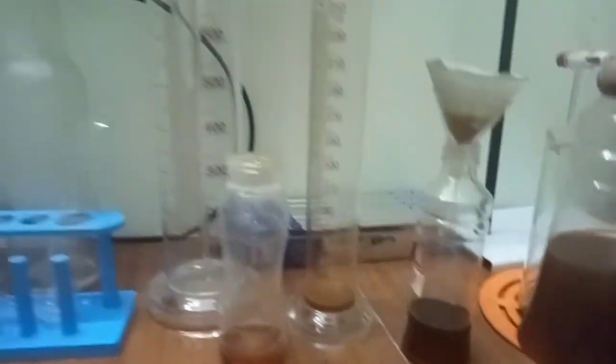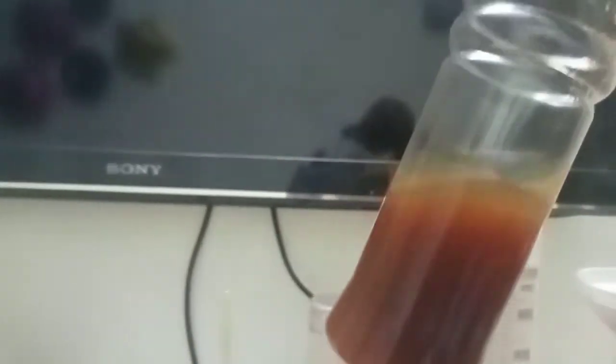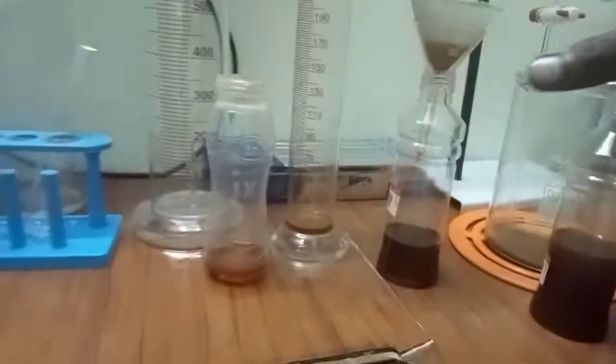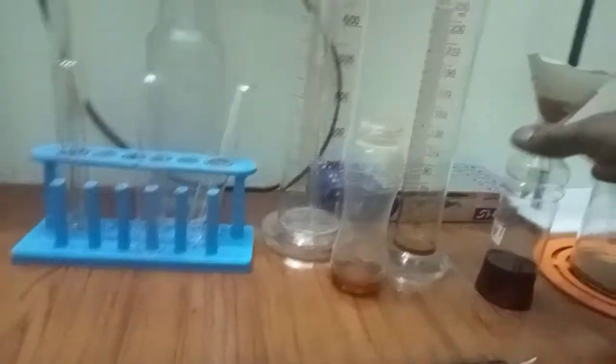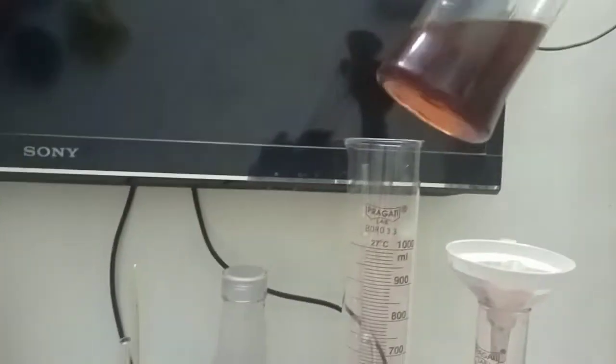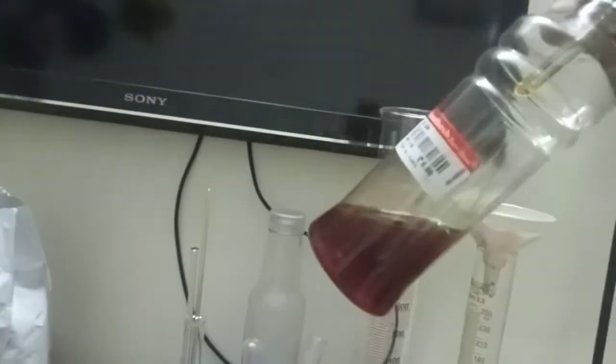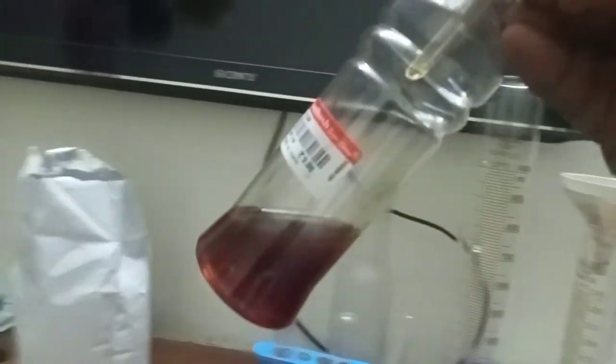So now I will show you in brief the results of this experiment. This is the oil which I have taken, and after the treatment. I hope you can see the equipment, simple equipment I have used, and the result.